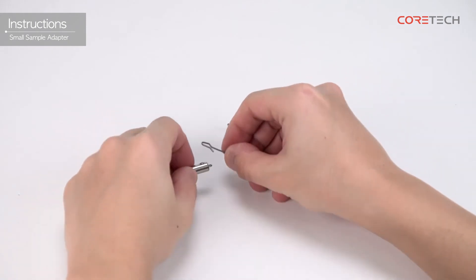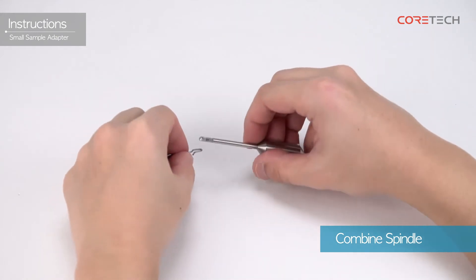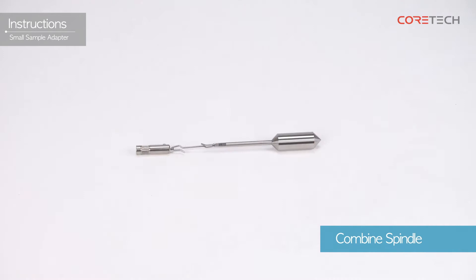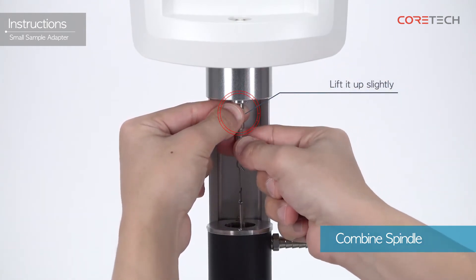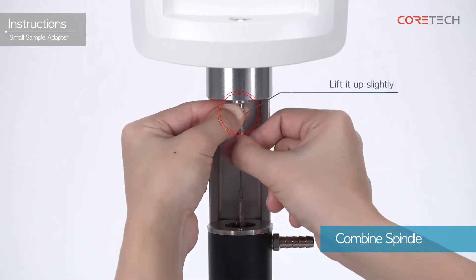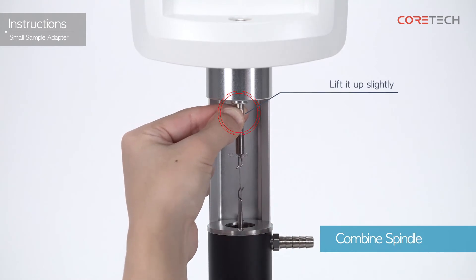Combine the coupling nut, extension link, and spindle. Attach the coupling nut to the coupling screw. To prevent damage to the pivot, lift the coupling screw slightly upwards when the spindle is engaged. With the coupling screw slightly raised upwards, rotate the coupling nut clockwise to engage.